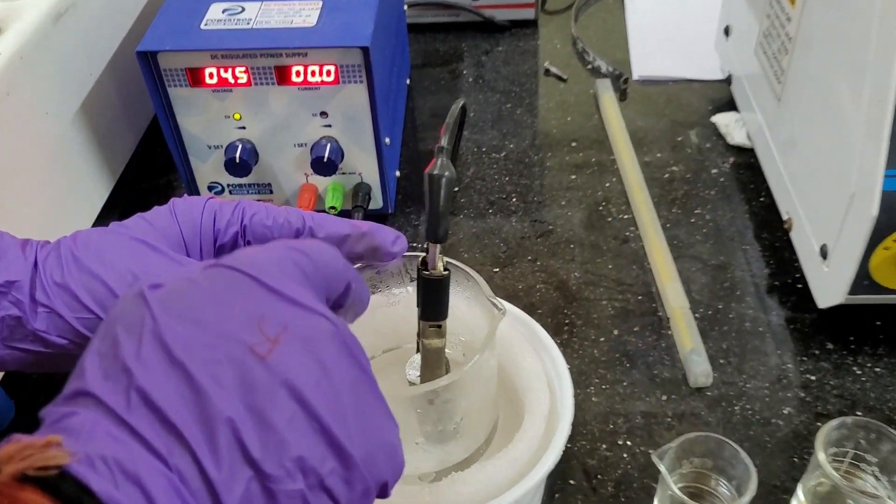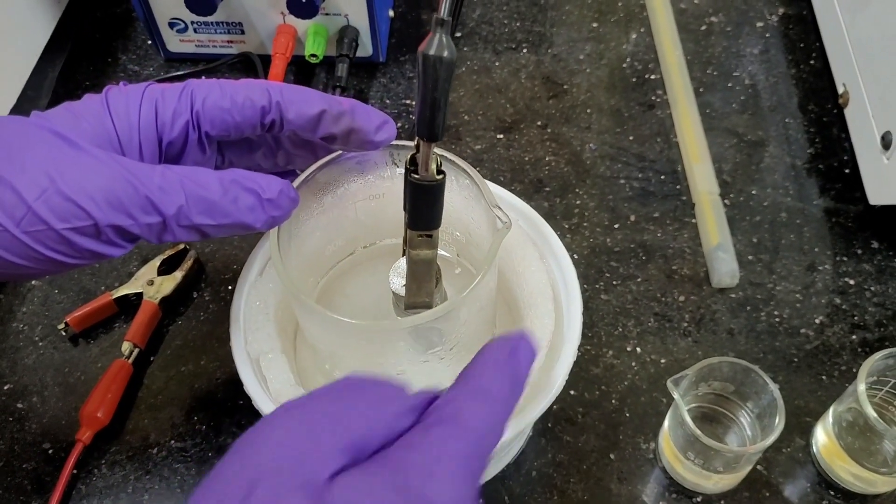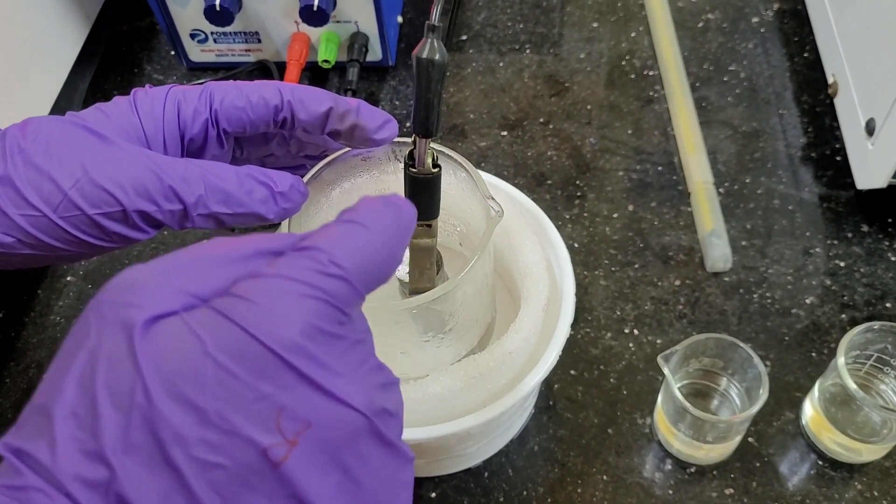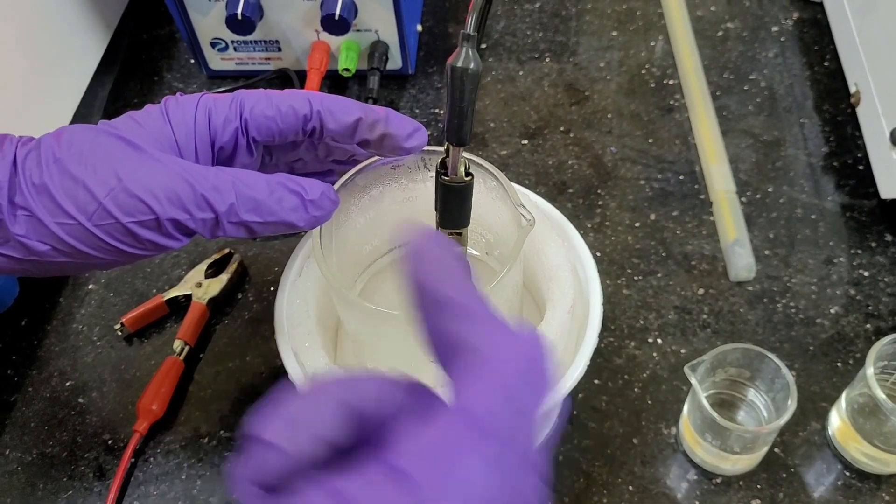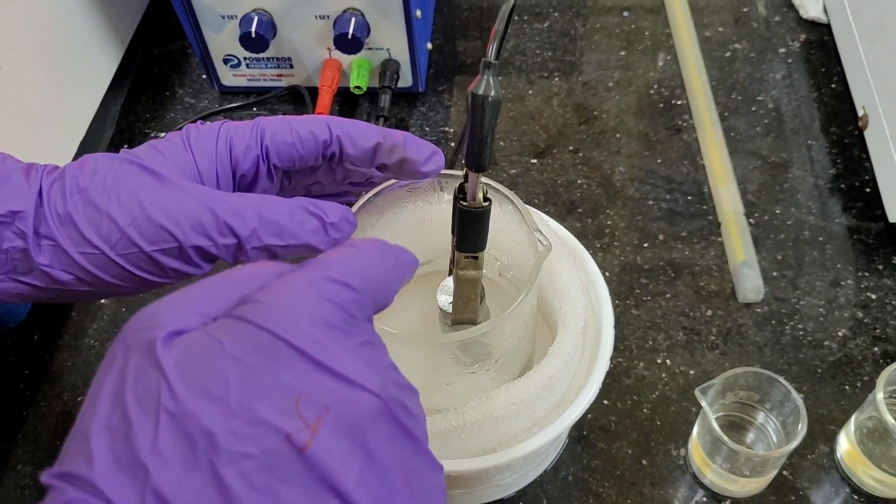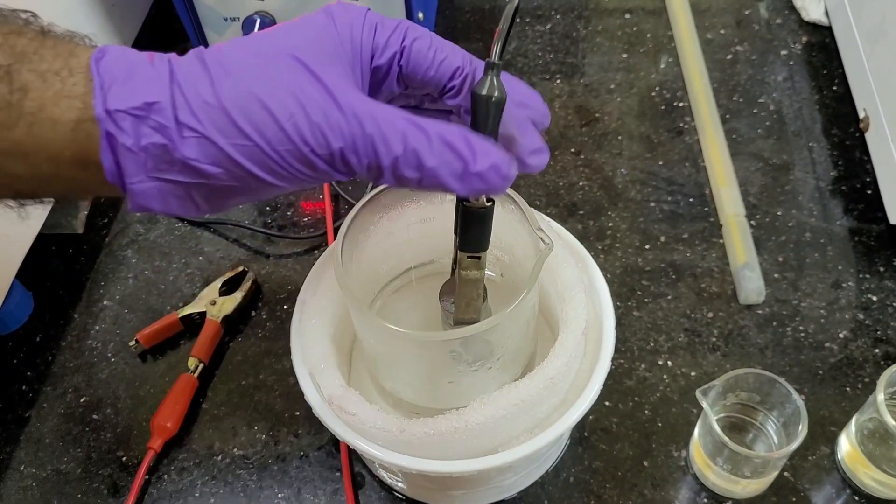Here, inside this beaker, this is the electrolyte. And outside this, there is a combination of methanol and liquid nitrogen to control, to build, to maintain the temperature inside this beaker in which electrolyte is there.